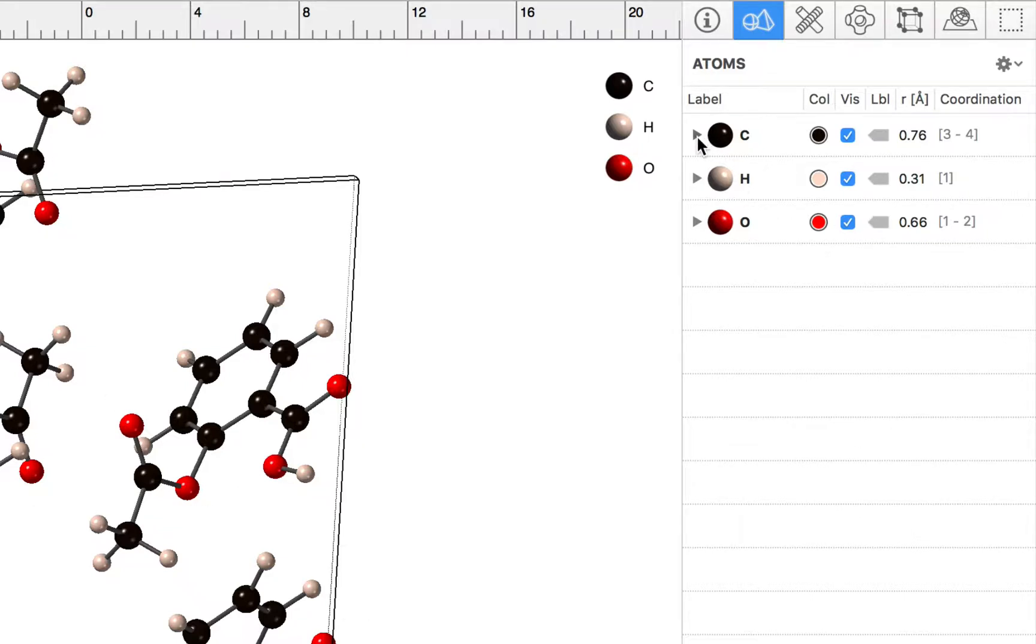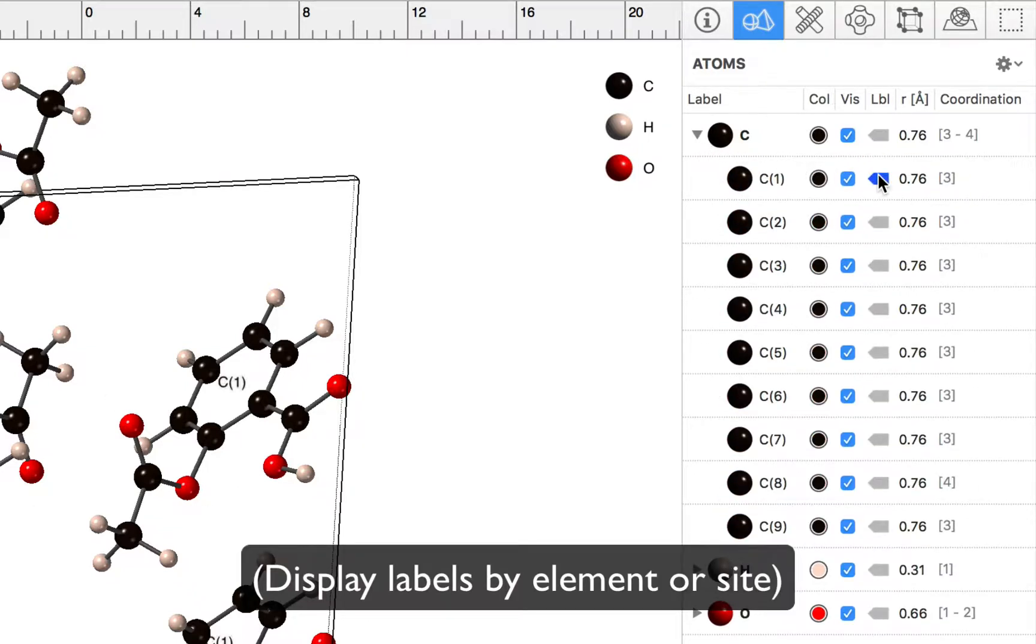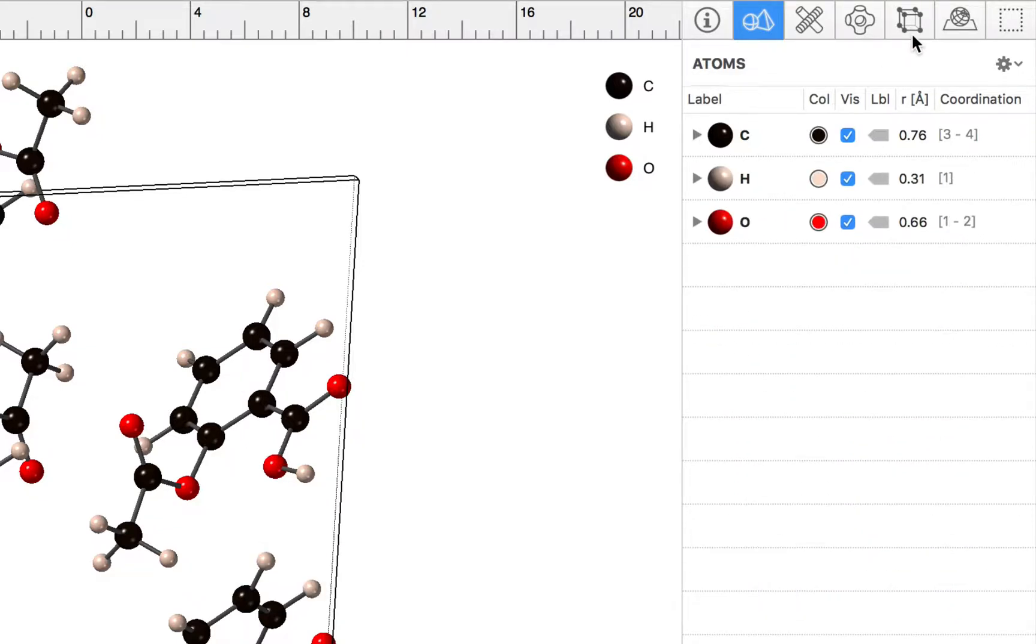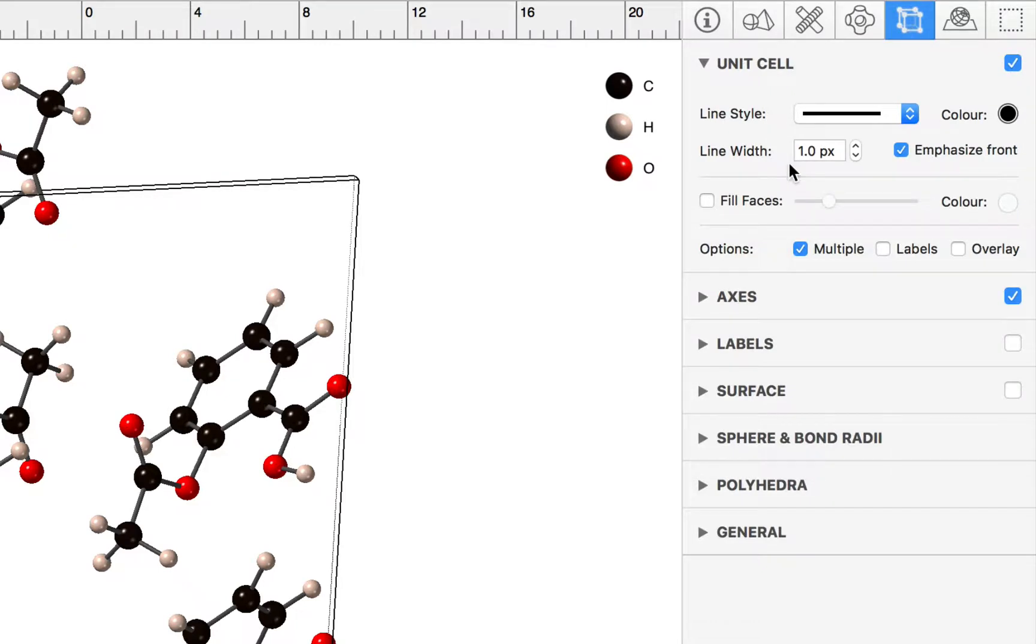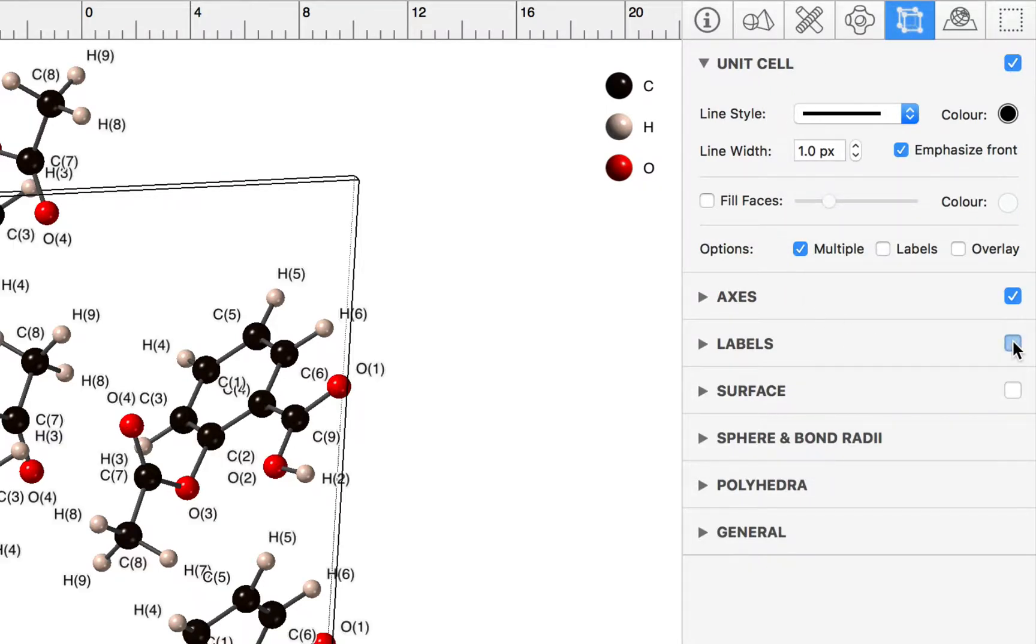We can also toggle labels on and off on a site basis, and we can toggle all labels on or off using the model inspector using the little checkbox in the labels group.